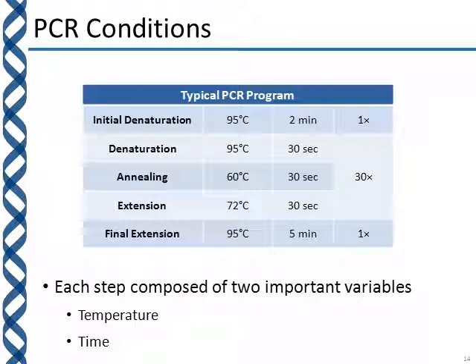And then at the end, there's a final extension step to allow the polymerase to essentially finish all of the synthesis of strands that it's currently working on, and that's done for one repetition.